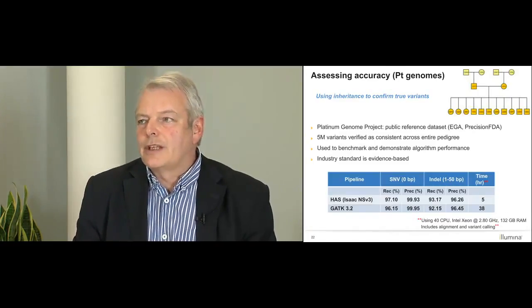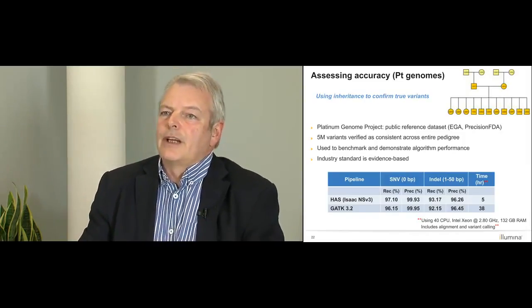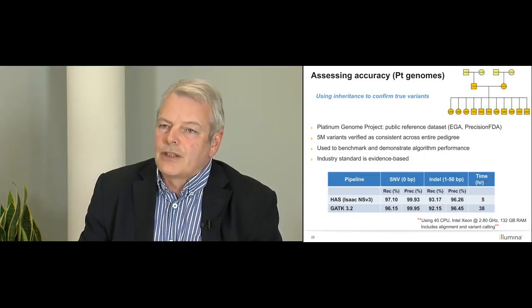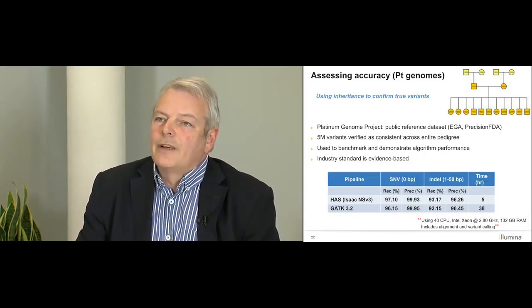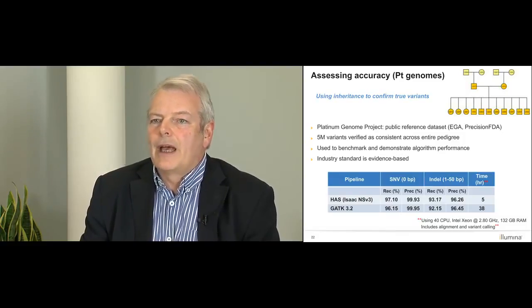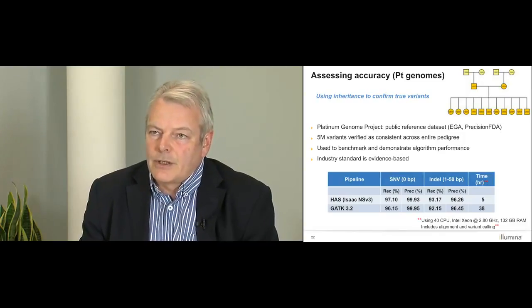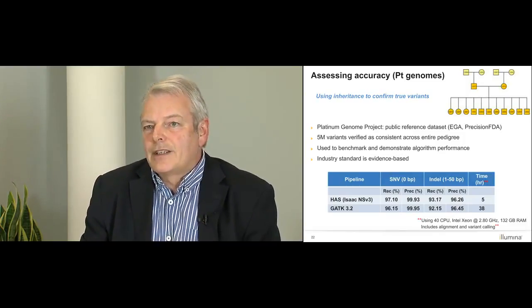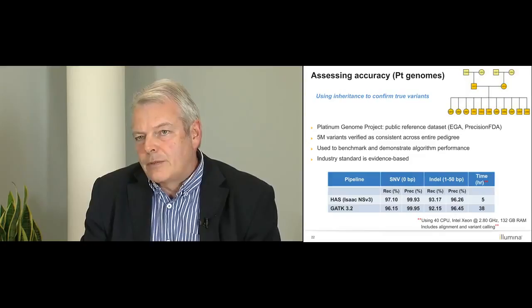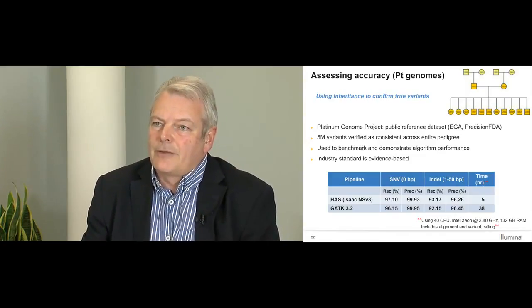Accuracy is another important area, and I won't go into this in great detail. There's a whole presentation on accuracy, but I do want to mention this project just in passing, where it is important to be able to objectively compare different analysis pipelines in adopting ones which are suitable for the project. And this illustrates a project that we developed in order to make that objective assessment. It's called the Platinum Genome Project. It's a public reference data set.